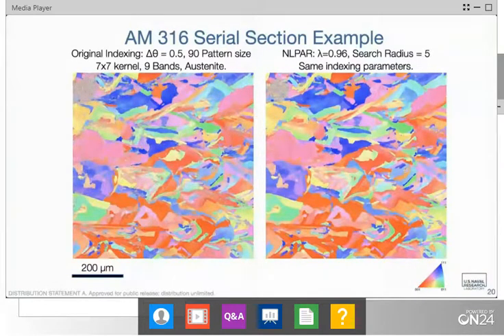Did I consider broad ion beam milling and looking to automate that? Yeah, that is certainly something that I considered, and I've looked with great interest into the broad ion beam methods. I think Philip Withers has done quite a bit of that over in the UK. He has started kind of pioneering that method.